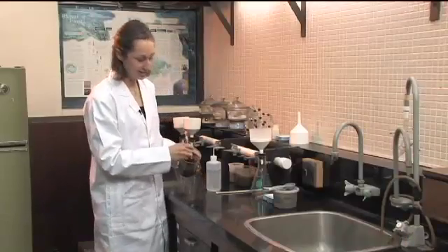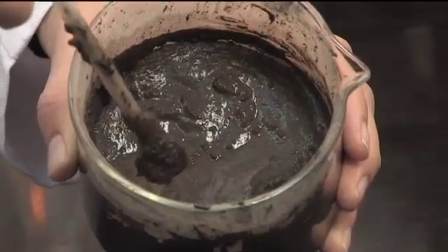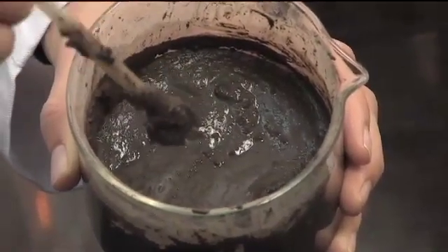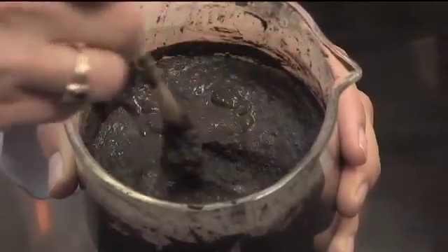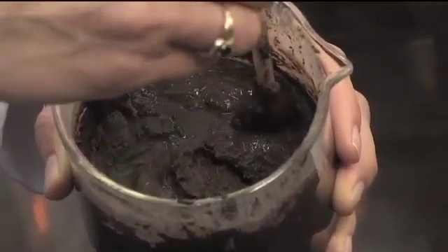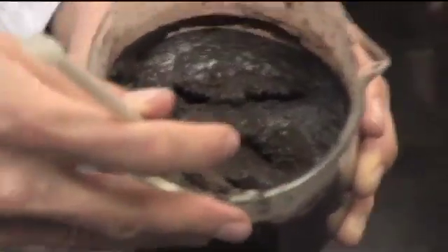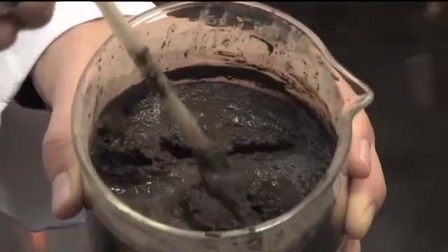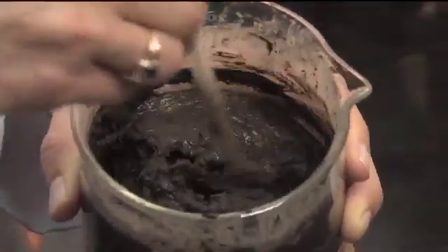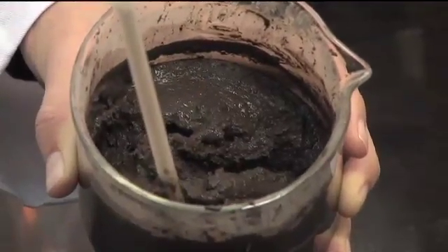That's getting close but needs to be fine-tuned a little bit. Here's a paste I already made yesterday. You can see the surface is a bit shiny, but there's no pooling water if I make a hole. Another test is that if I draw a line in it, it's going to be able to fill back in. The entire sample is moist and able to flow — that's what you're aiming for with your saturated paste.